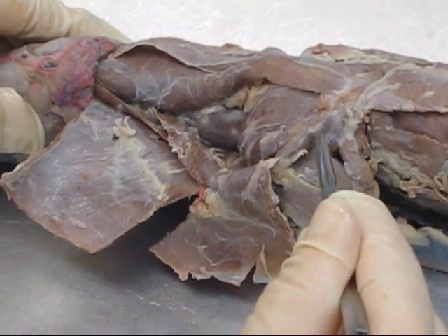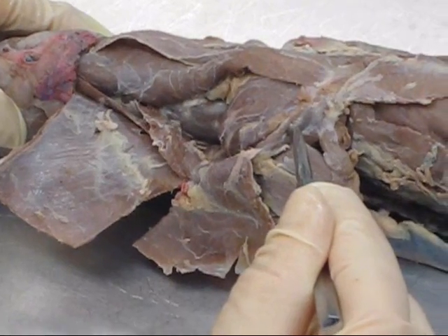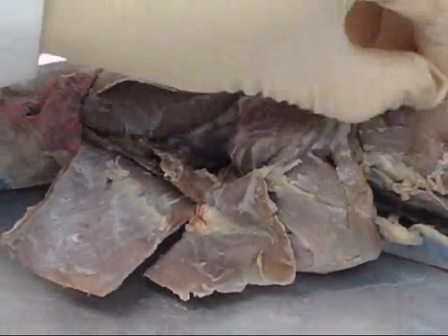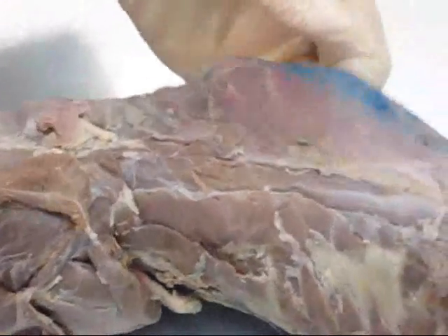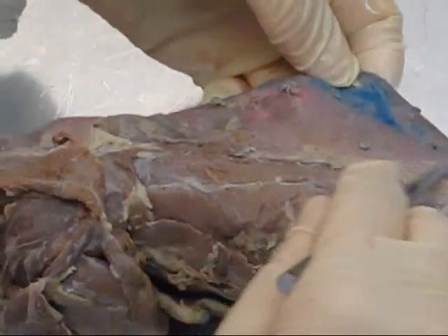Another deltoid muscle — this is spinodeltoid, right in here. Then you can see on the other side of the mink, what was this big muscle in the mink's back called? Latissimus dorsi — very nice — way back in this region.